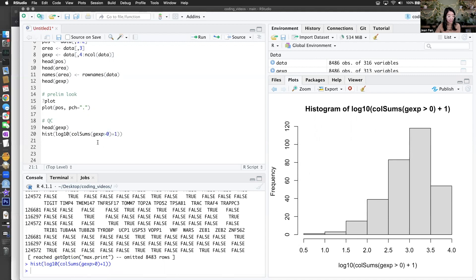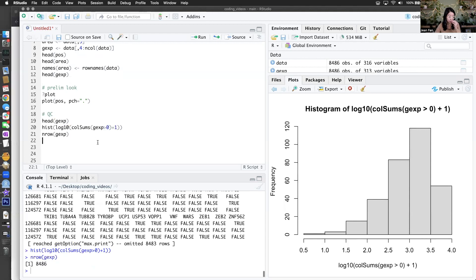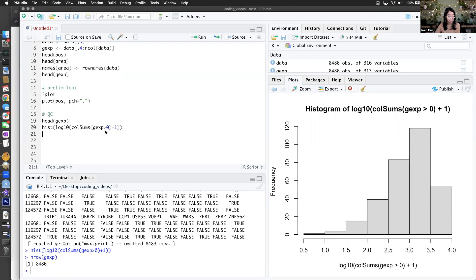I've downsampled this data so that it's less than 10,000 cells so that hopefully it won't overwhelm students' computers. We have some genes that are pretty rare — maybe they're lowly detected, maybe they're marking rare cell populations. This will be up to the students to figure out. We can visualize things as histograms, as distributions.